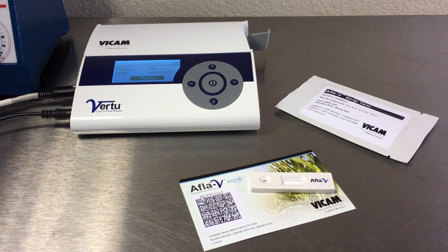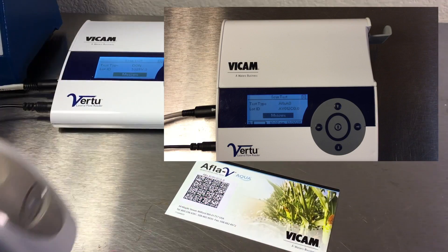Each kit will come with a barcode unique to the production lot. Scan the test kit barcode. The Virtu Reader screen will show the production lot number and will match the production lot number on the strips.